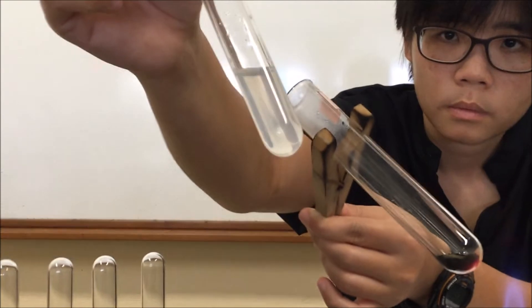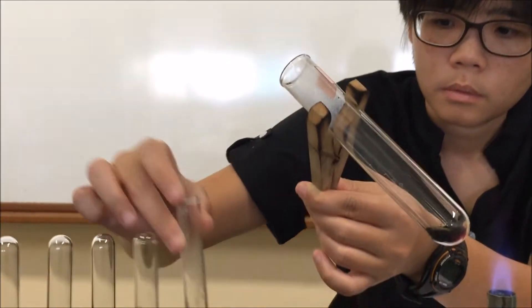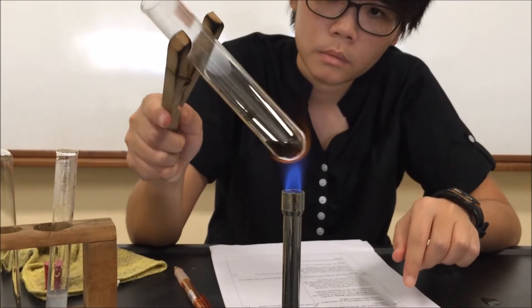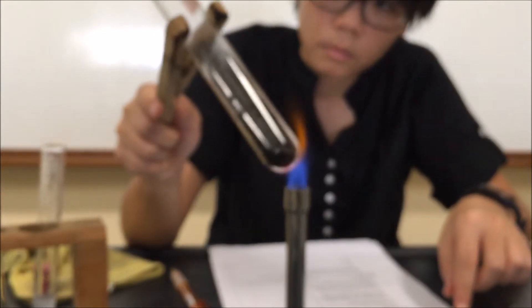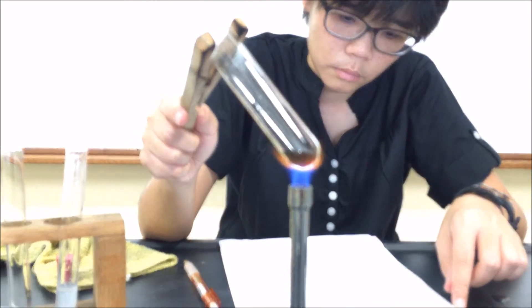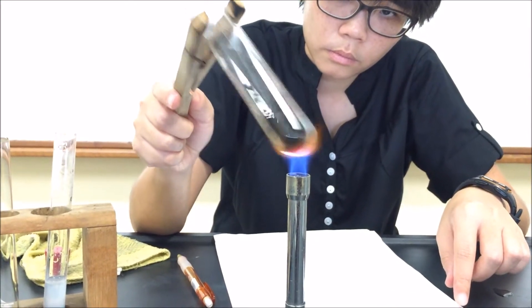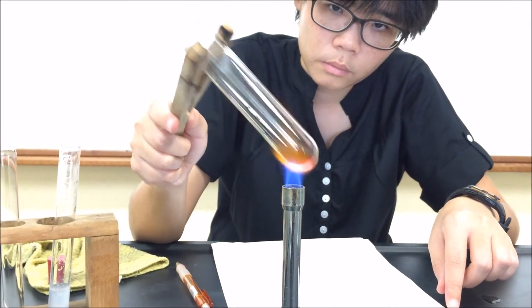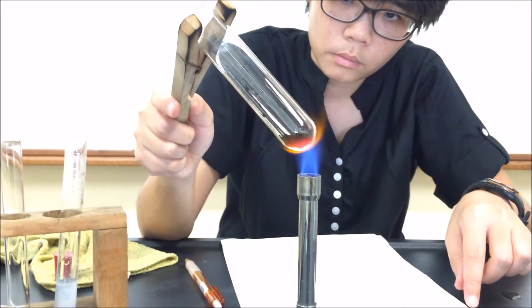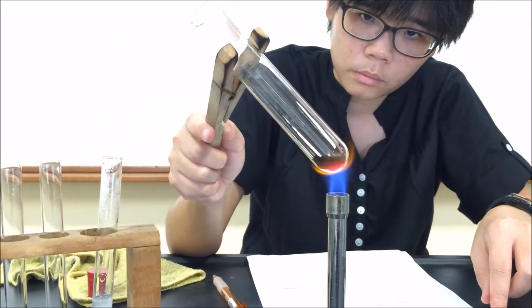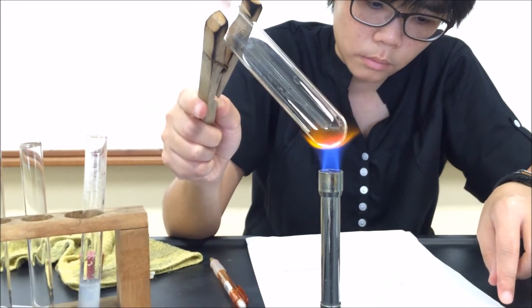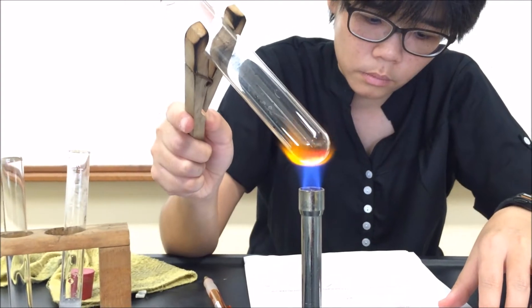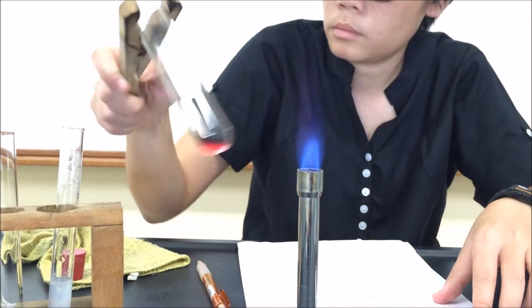So we see that the green solid has turned black. Because we will need to use the contents of this tube for the next part of the experiment, we need to ensure that the decomposition of this green solid is complete. Which is why I continue to heat the green solid for a while more, just to make sure the decomposition is complete, and then my results will be accurate.